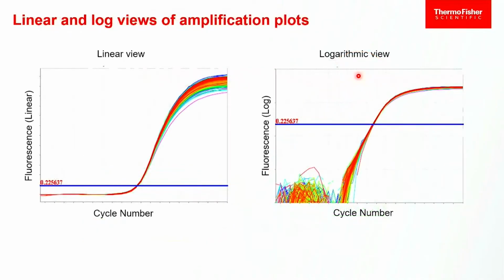When we actually do our data collection, it's really hard to look at this point and say, what's the right place to put this threshold? Where do I actually want to gather that data? This is on a linear scale, so it's hard to see here, but remember, this is a twofold growth process.